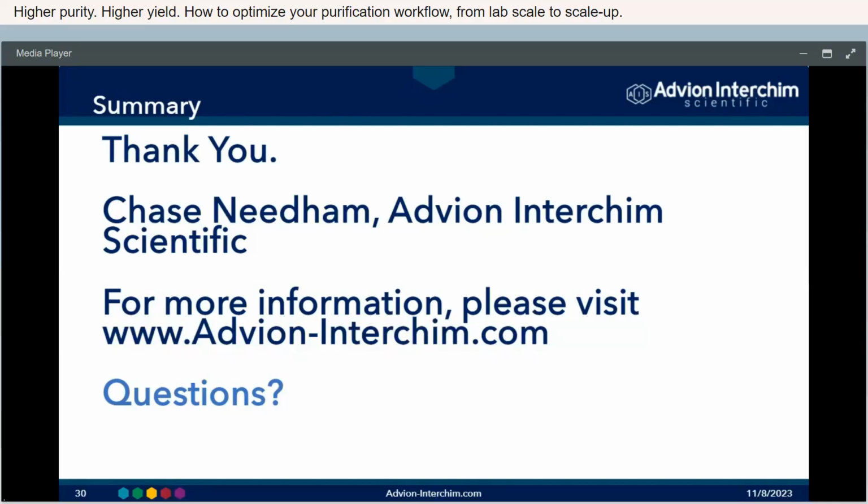Great, thank you, Chase. This next question asks, what is the advantage of smaller particle size silica? Okay, so I mentioned that we have 15 micron silica. The standard silica for most purifications is a 50 micron particle size. The smaller the particle size, the higher the efficiency of the purification media is.